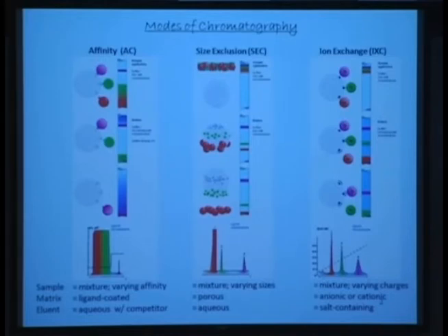And we can't really control this. The membranes cannot really just say 1,000 is exactly 1,000. Obviously, this is related to the pore, and the pores typically have their own distribution. So it's usually not 1,000. Many times even 2,000 molecular weight molecules can pass through.